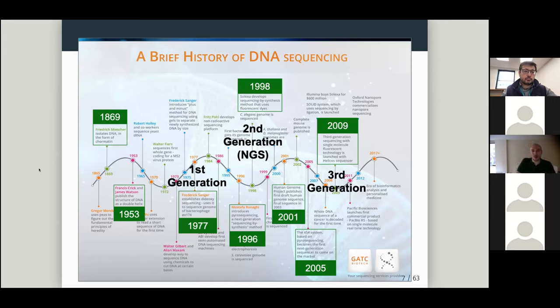So going a bit back in time, well, let's forget about 2 centuries ago, but even after the DNA was first described, we can distinguish at least 3 main events in terms of technology development. And now we are in this so-called, or at least by some defined as, third generation era of sequencing, which really allows us to generate reference quality genome assemblies for many, many species at scale. We're not there yet; even these efforts, as we said, with VGP is in its first phase, and it's actually pretty advanced compared to other projects. So we are really seeing the beginning of this effort at the global level, but we're not there.